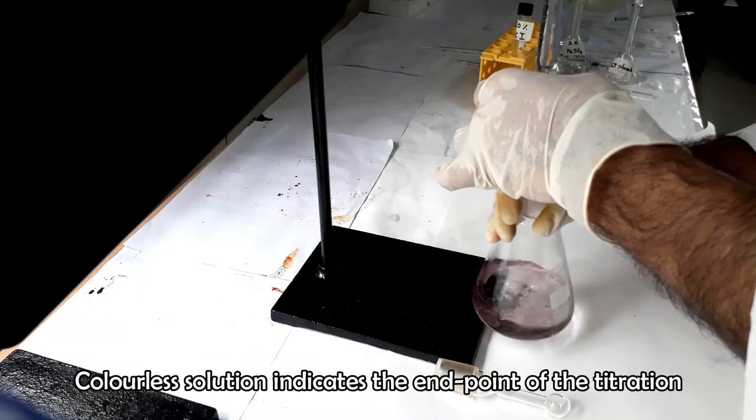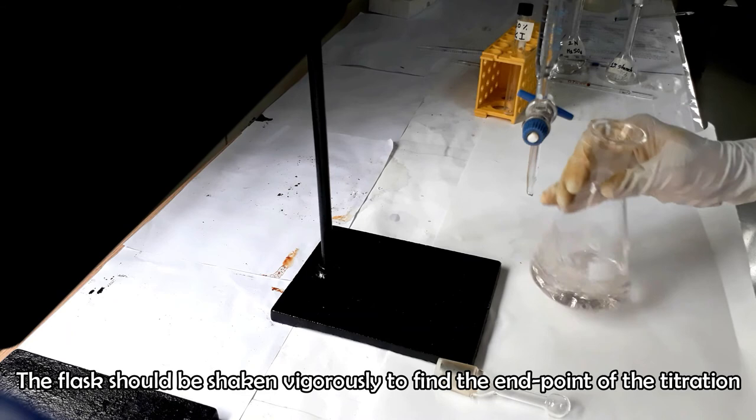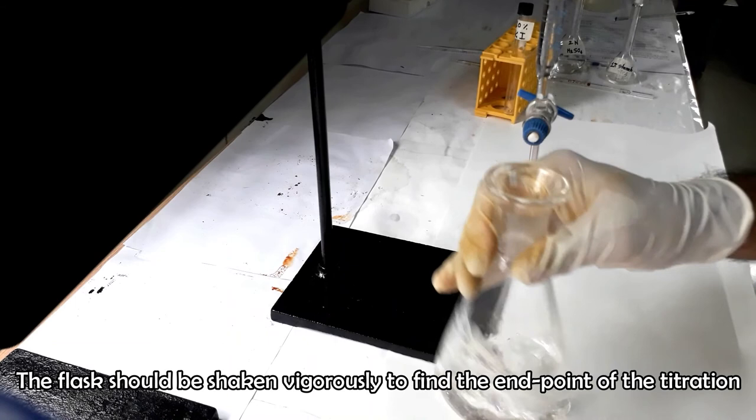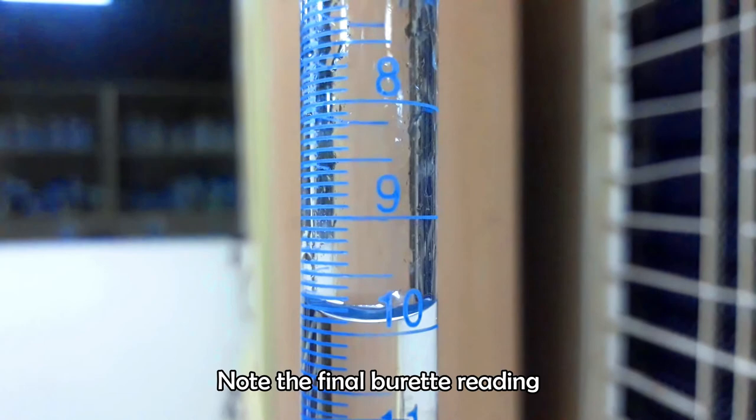Stop the titration when the solution color becomes colorless. Note the final burette reading.